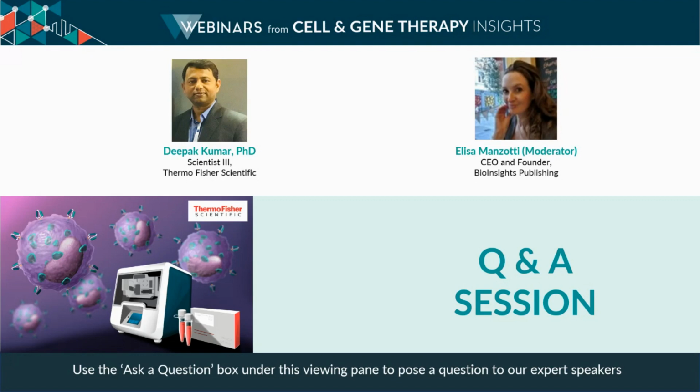Another question from the audience: what is the AAV MOI used after electroporation? I used 100K MOI. First we optimized different MOIs, and we found that 100K MOI gave the best result. That's why we use only 100K MOI here.